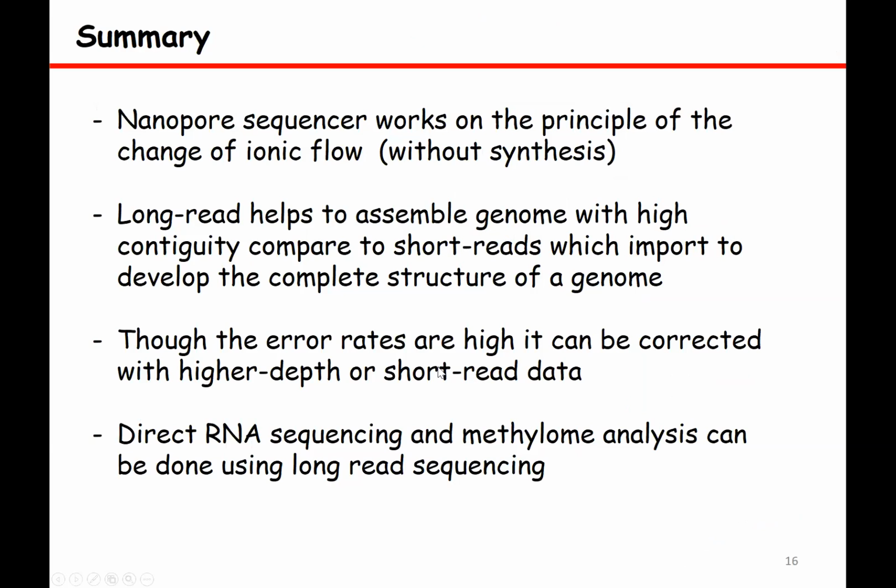Okay, summarizing my talk. In this talk, I hope I have explained what nanopore sequencing technology is, how it works, and the principle of the change in the flow of the ionic current, which causes the changes in the graphic pattern. It does the sequencing without synthesis, unlike any other sequencing technology available. That's why this technology is used in space as well. Nanopore reads help to assemble genomes of really high complexity and bring them into nearly continuous full length assemblies.